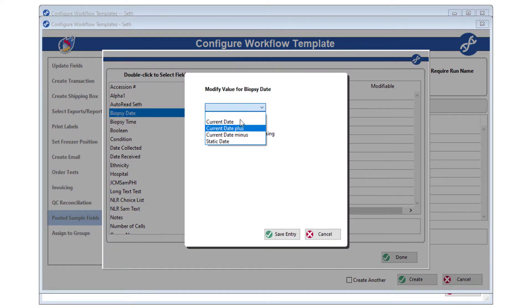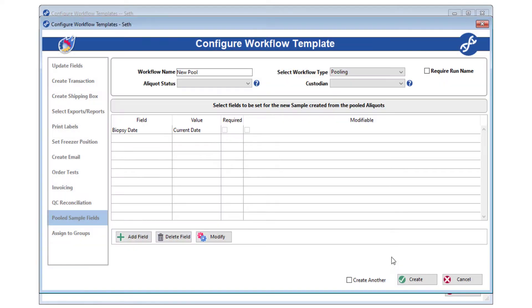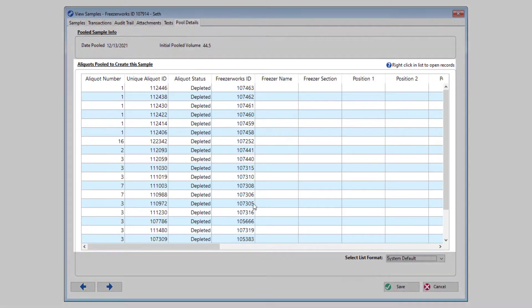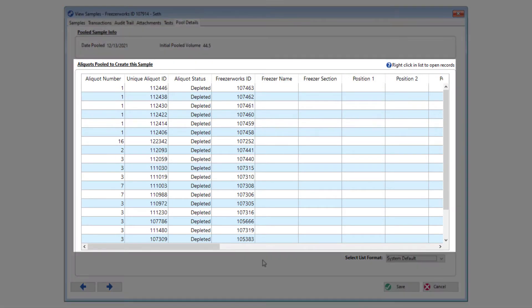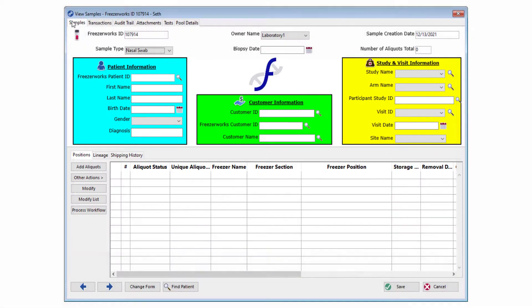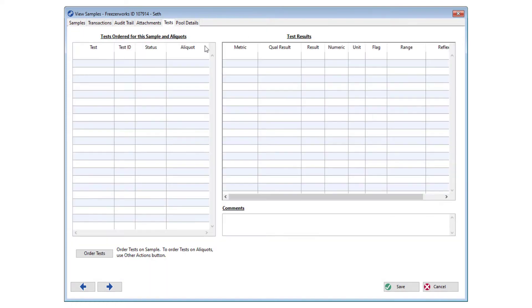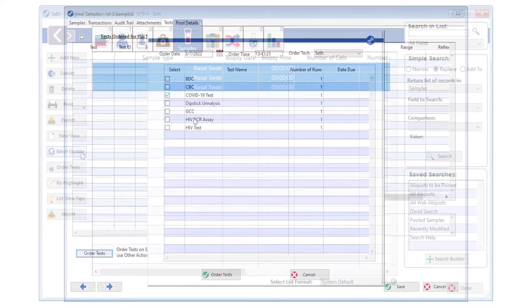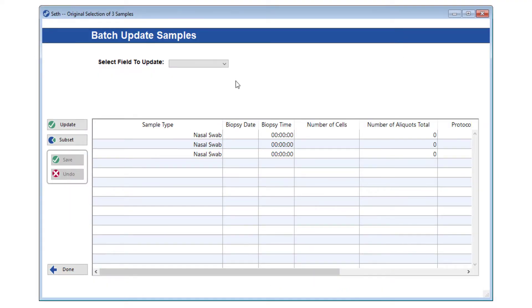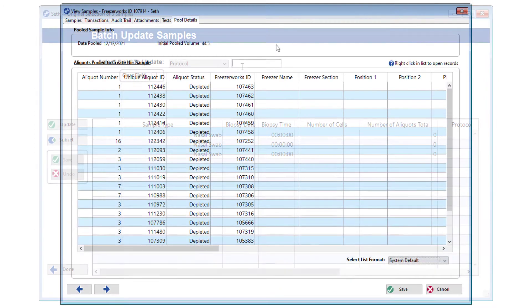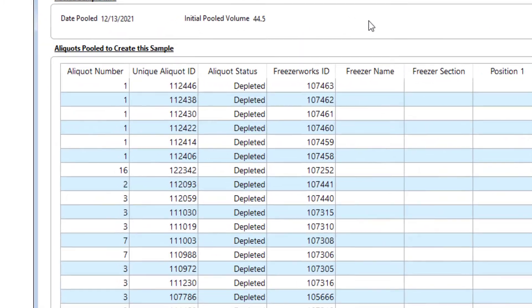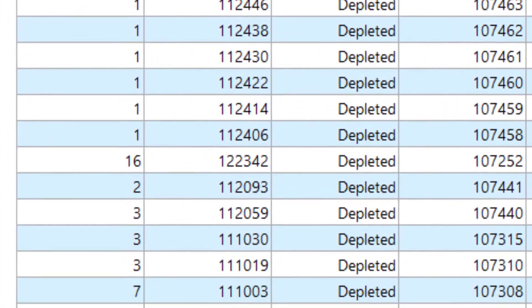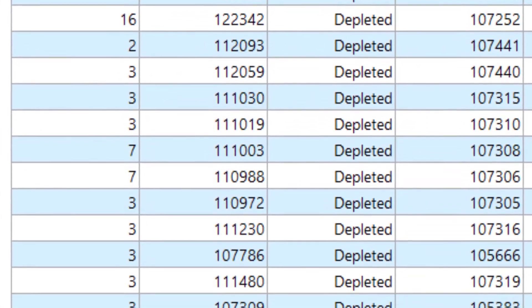Now, you can run a workflow that will also combine the data of the aliquots you are processing to create a new pooled sample. Pooled samples can then be tested and further manipulated using all the features FreezaWorks has to offer, all while maintaining the traceability and metadata of each aliquot that was used to make it.